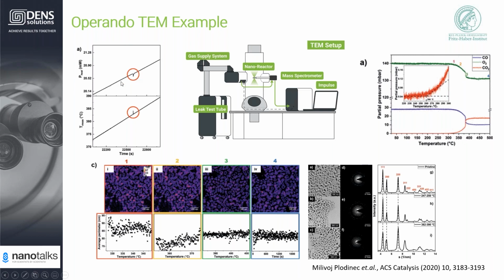These are all revealed. So both of the examples, from FHI Berlin and from the National University of Singapore, are telling us the carbon monoxide oxidation reaction is an exothermic reaction. When the amount increases suddenly, it releases a lot of energy to the system. It will cause an instant localized temperature increase in our system. But as introduced in the former session, our system has a feedback system, and it wants to bring the system temperature back to your control. So there is a decrease of the heating power to bring the increased temperature back to the user's set value.